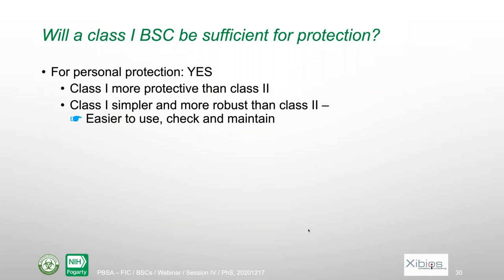The next question is, will a class 1 BSC be sufficient for protection? For personal protection, yes, no doubt about that. Remember that class 1 is more protective than class 2, and it's also simpler and more robust than class 2. That means it's easier to use and also easier to check and maintain.